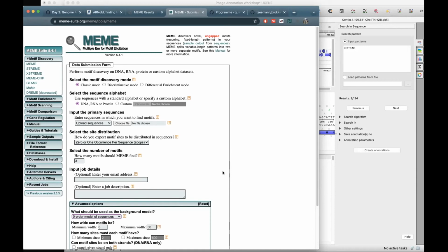If you do a pattern search, because you can also use pattern searches or very short BLAST searches, but then your e-values will be really high against yourself, then you might be able to use that rule better. And Andrew has given a lot of alternative resources to look for promoters, so they might be able to incorporate it.